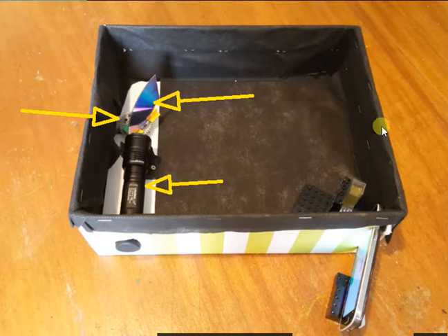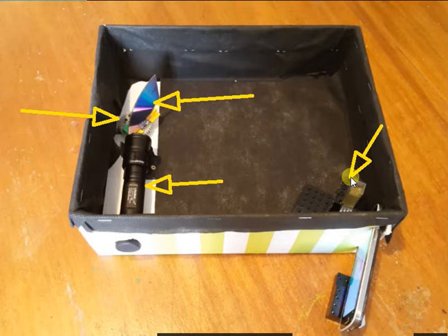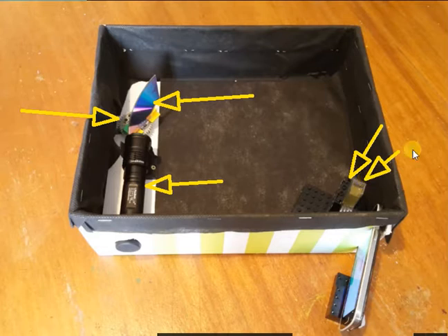Not shown on this picture but you'll see it on the video I'll show you in a second is a slit which further allows the selection of a wavelength, or most likely a narrow range of wavelengths, to send through my sample. The sample solution is in this cuvette here, a clear one. This one's plastic, you can get them made out of other things.